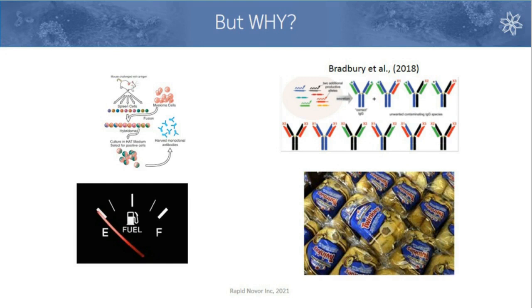So aside from that, we've seen issues where people can't source an antibody. Maybe you're working with a vendor. Maybe they've been selling you an antibody for the past couple of years and you've been running preclinical assays with that antibody of interest. But now, 2 or 3 years later, they run into one of the issues I mentioned above. Now the antibody that they're sending you is different, and thus you've got a different antibody in your hands and on your preclinical assays, and you're heading into submitting that data for evaluation, and you can't recapitulate the original results that you've been developing for the past couple of years. And that's a big problem, right?